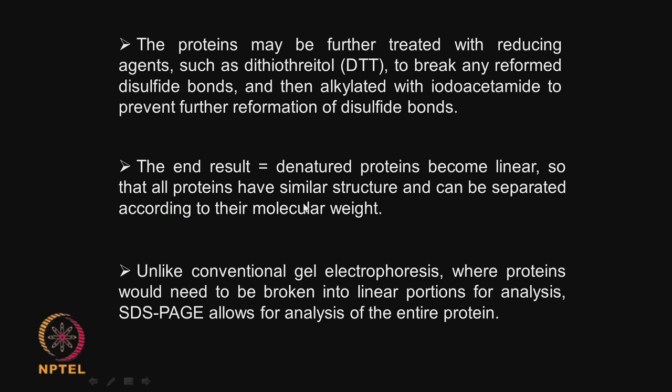So, in SDS PAGE, you are separating proteins only on molecular weight. You are not looking at the 3-dimensional structure, conformation, and so on. Unlike conventional gel electrophoresis, where protein would need to be broken into linear portions, in SDS PAGE we can look at the entire protein in the linear form. That is the advantage.